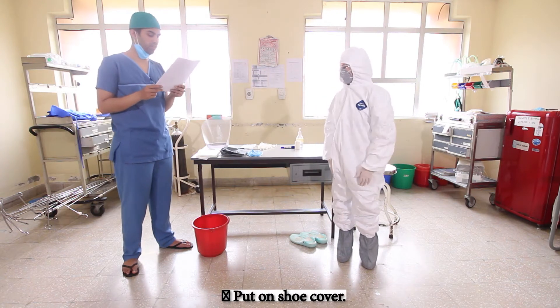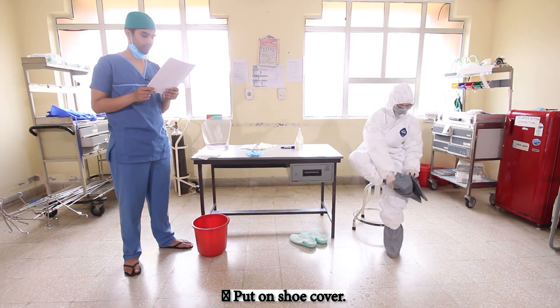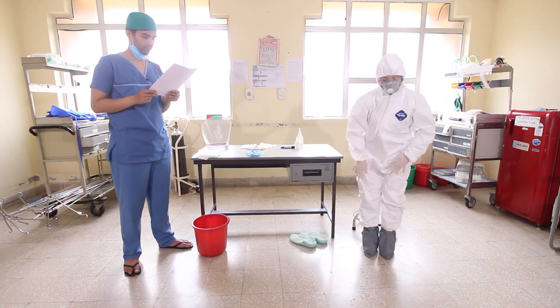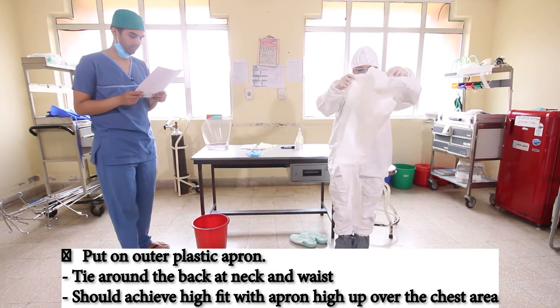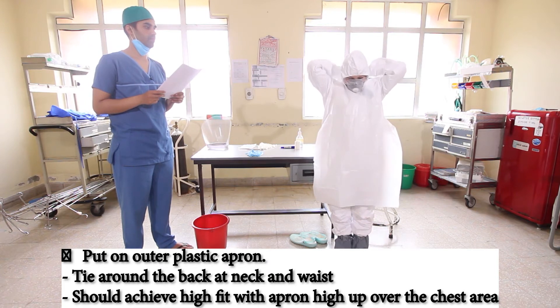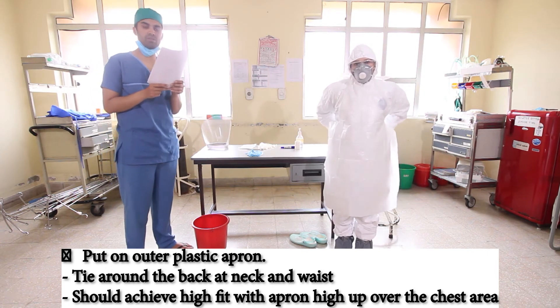Now put on the suit cover if available. Then put on the outer plastic apron. Take care that it is tight around the neck and the waist, achieving a high fit with the apron to cover the chest area.